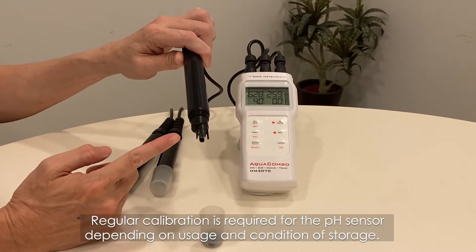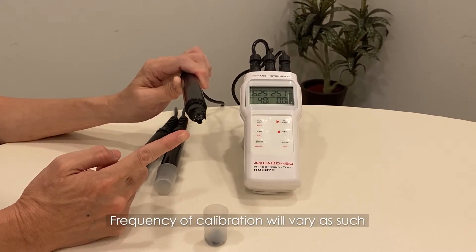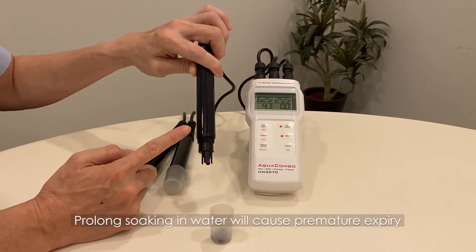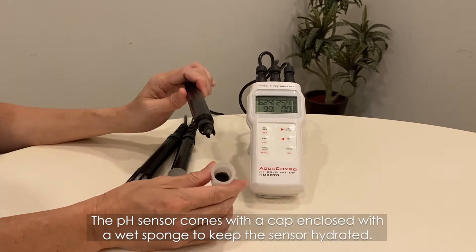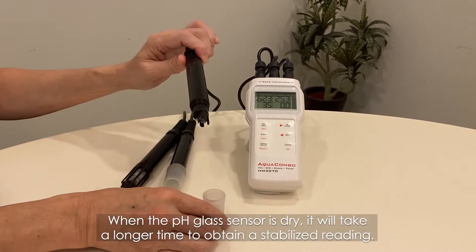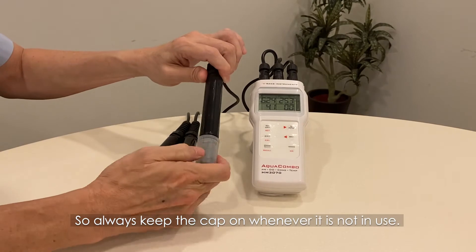Regular calibration is required for the pH sensor depending on usage and storage conditions. Due to the chemical content in the sensor, it is made for dip tests only. Prolonged soaking in water will cause premature expiry. The pH sensor comes with a cap enclosing a wet sponge to keep the sensor hydrated. When the pH glass sensor is dry, it will take longer to obtain a stabilised reading, so always keep the cap on whenever not in use.